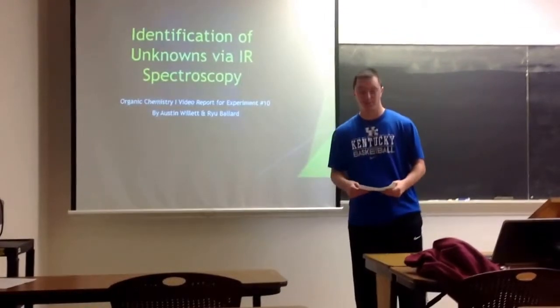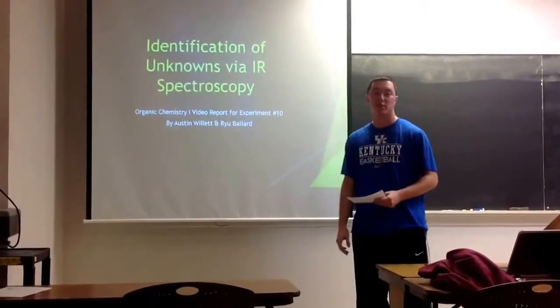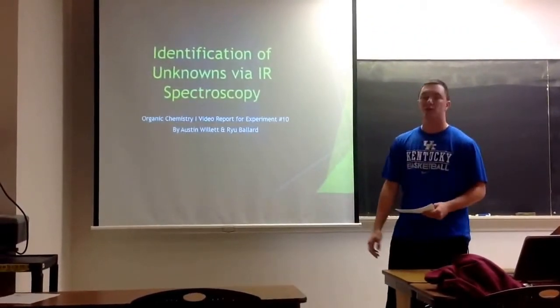Alright, this is going to be my formal lab report video for experiment number 10 regarding the identification of unknowns via IR spec.